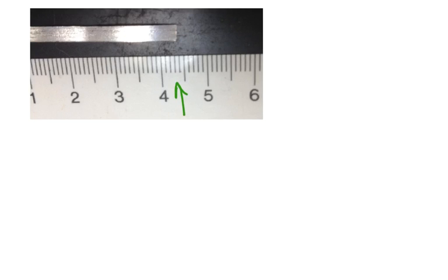And remember, these kinds of measurements should be something like 4.50 centimeters. Since each line on the ruler represents 1/10 of a centimeter, your measurements ought to go to 100ths of a centimeter. So be sure you go 2 decimal places on those.